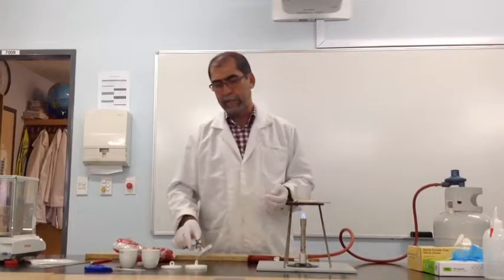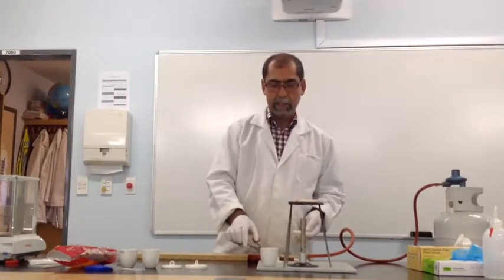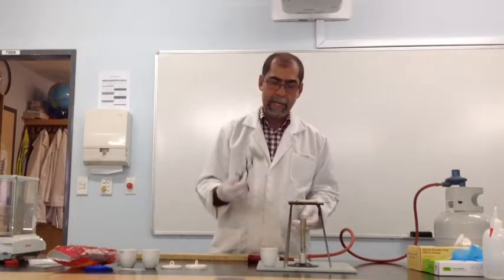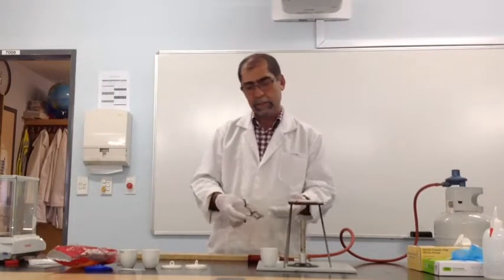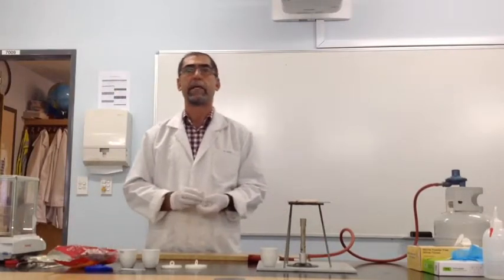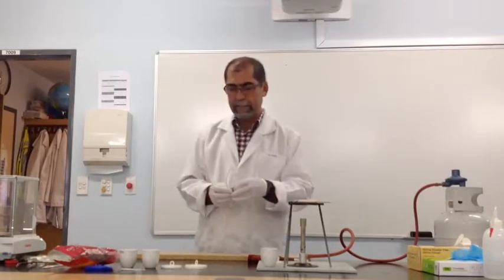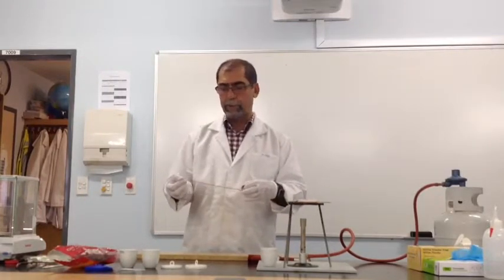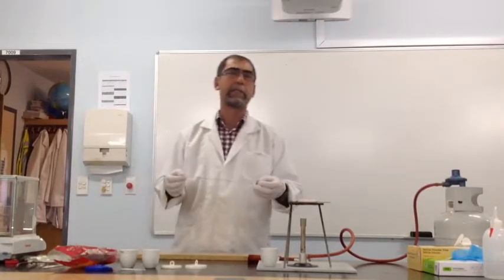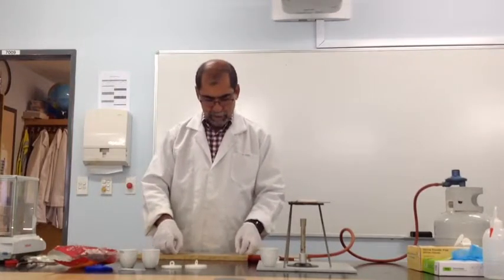And we will do the same thing with the lid. Okay, now our crucible and its lid have been heated and treated so that all organic matter is burnt. While this is cooling, this is our chance to start preparing the next item in our experiment. The next item is magnesium ribbon. That's what we're going to use in our experiment. Typically, I will say use approximately 15 to 20 centimeters of magnesium ribbon.